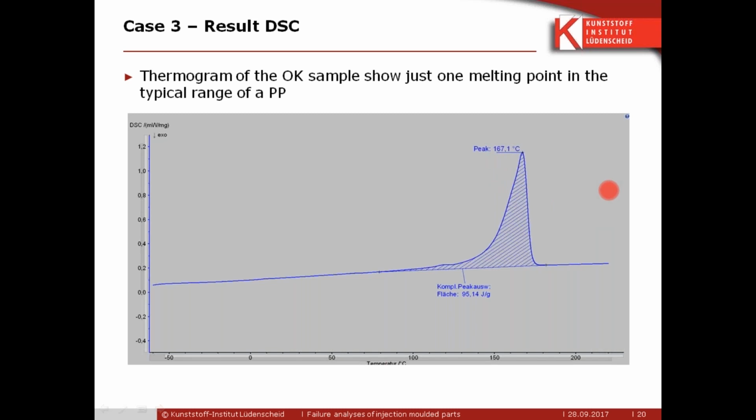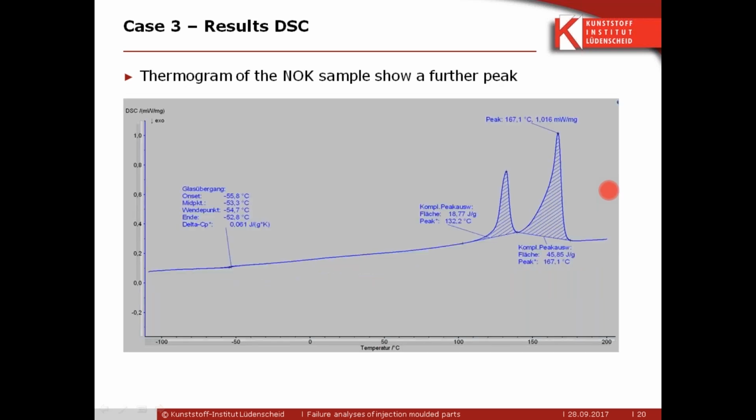Moreover, our customer had problems with brownish streaks on the parts, and earlier production batches do not show these problems. In this case, we used the DSC again, this time in combination with the Identify option of the NETZSCH Proteus software.